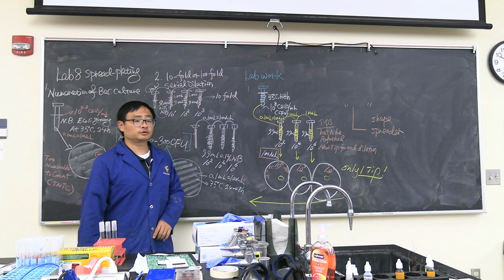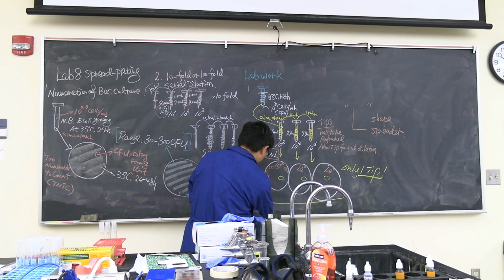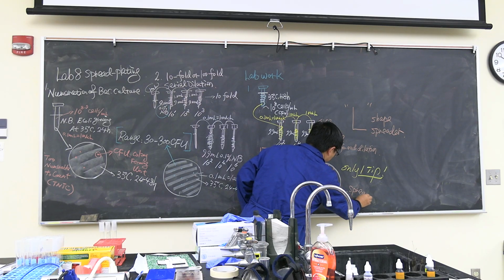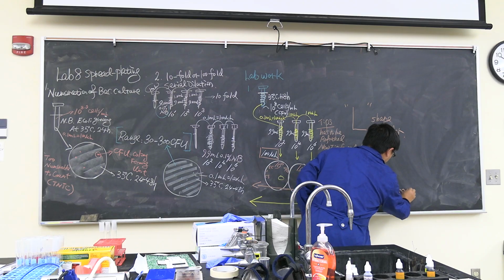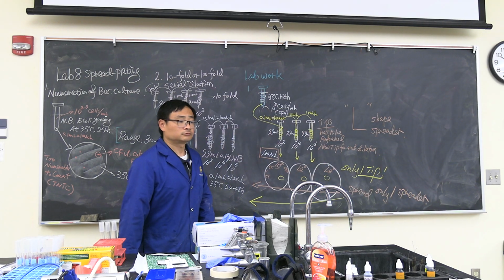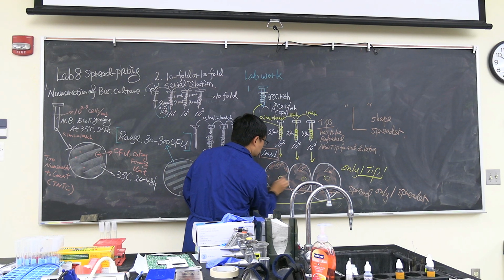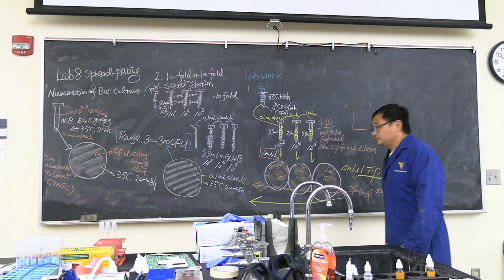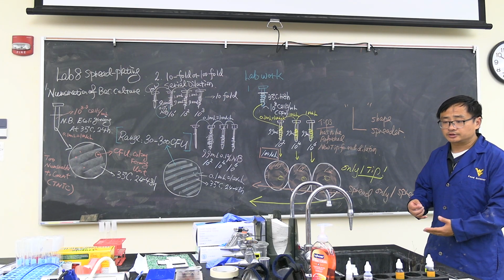The spreader, how are we going to do? Same thing. Spreader from high to lowest dilution. Only 1 spreader. Okay? From here you spread it, go here, and then go here. Then you need to let them be dry a little bit, stack it together.